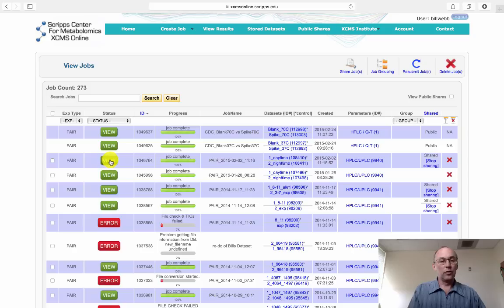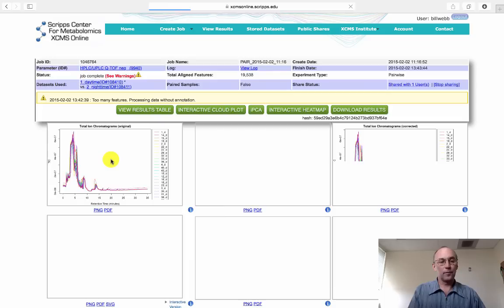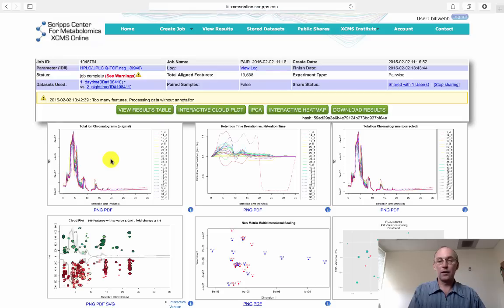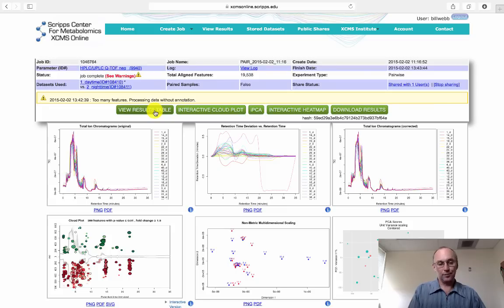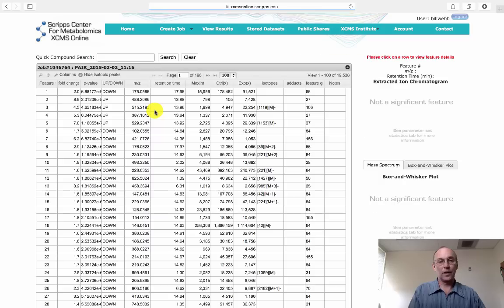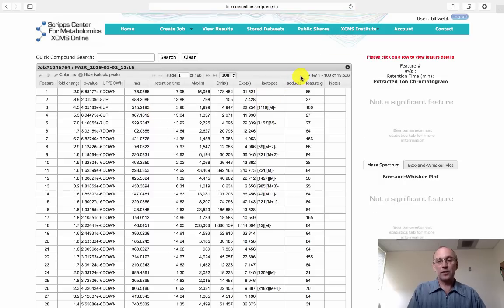So we'll go to the particular job that we ran, click on the view icon, and to look at data for each individual feature, we'll go to view results table. In this particular experiment, over 19,000 features were found.